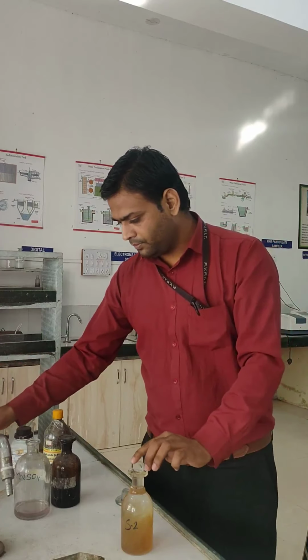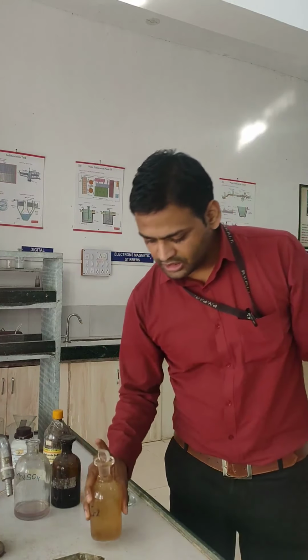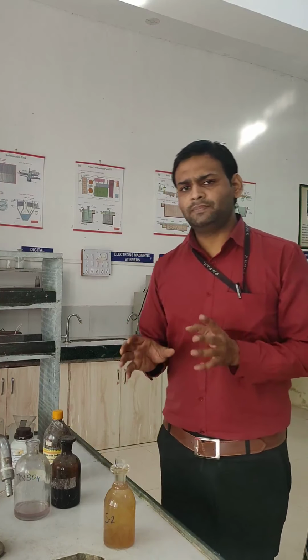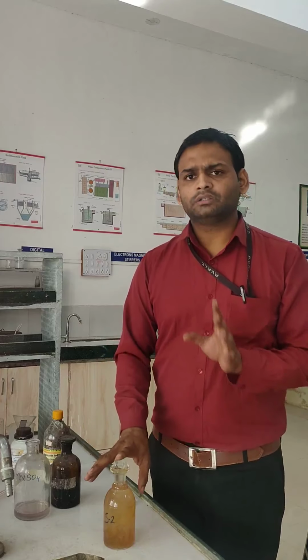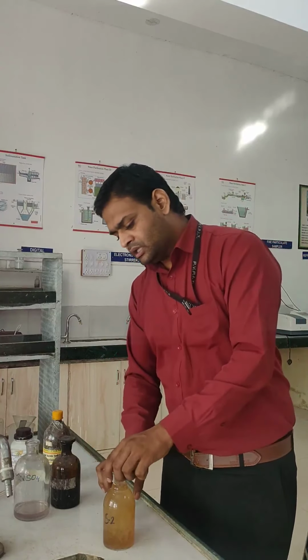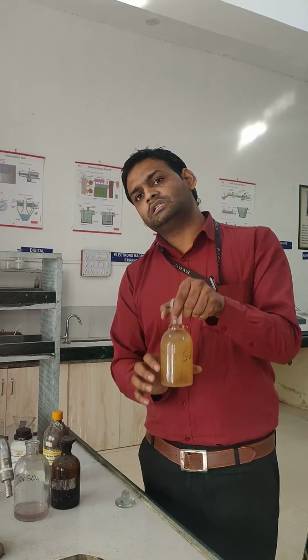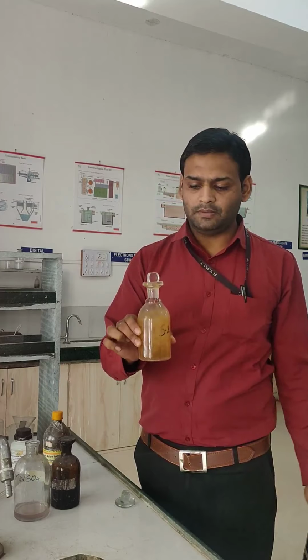A brown color will form. This brown color represents that dissolved oxygen is present in the water sample. If the color is white, it means the dissolved oxygen is absent from this water sample.